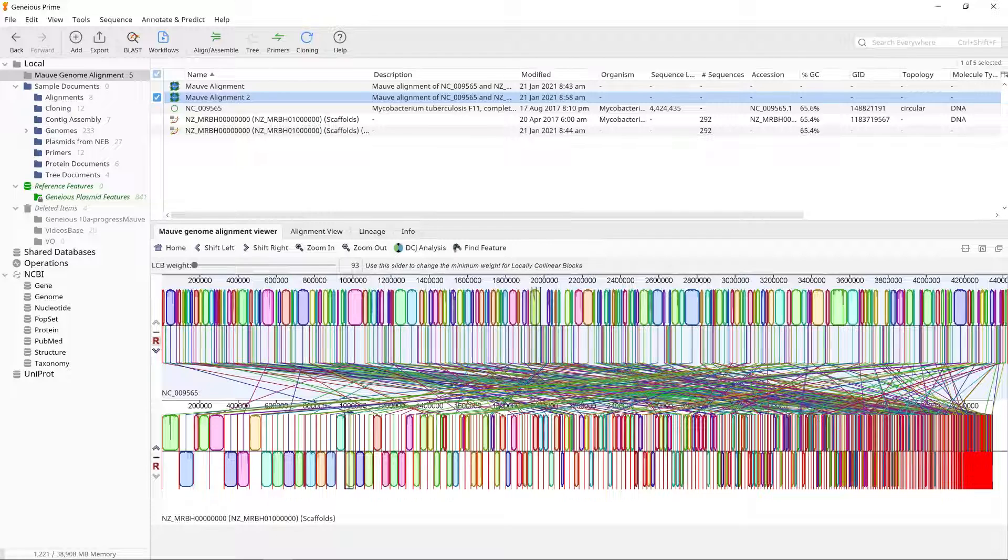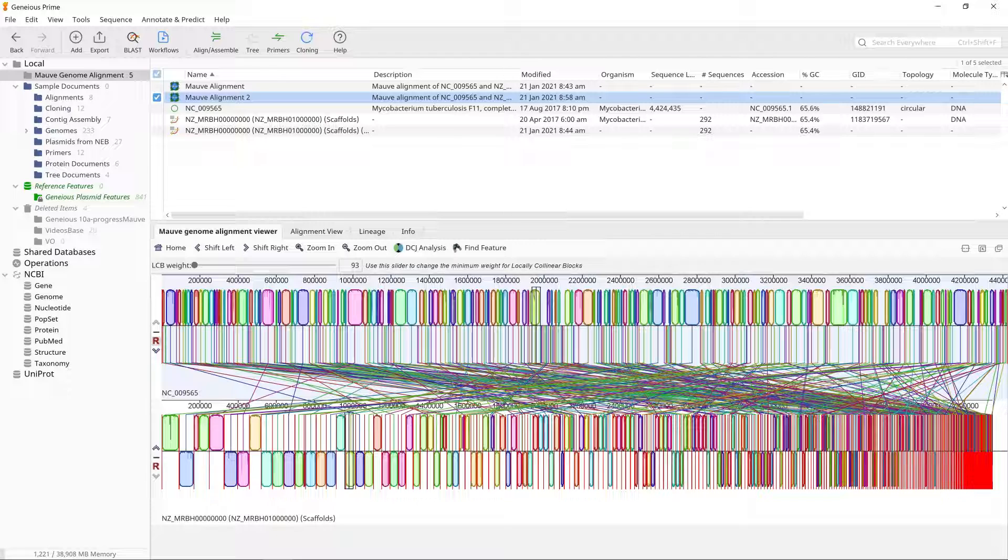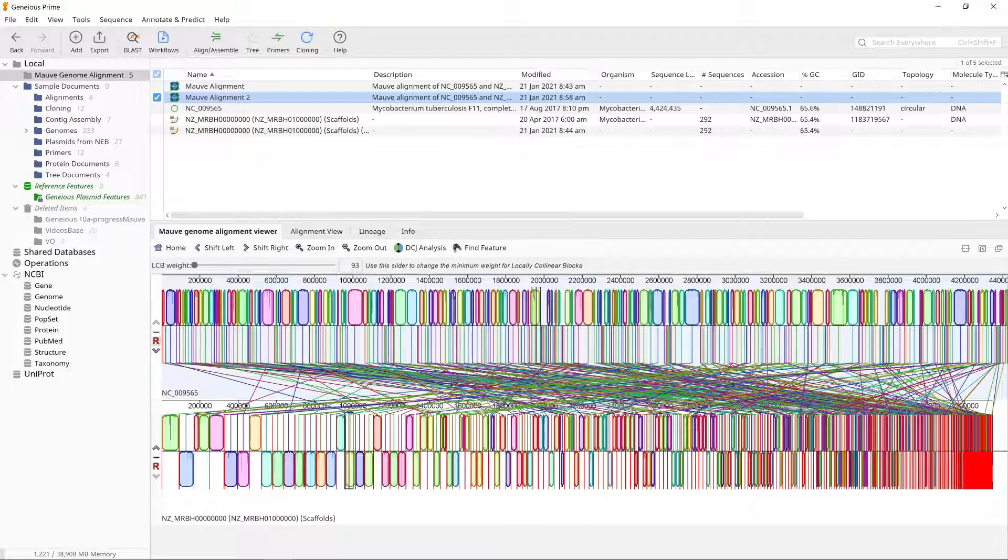As this concatenation step is unlikely to order the contigs correctly, the minimum number of LCBs in the alignment is probably going to correspond to the number of contigs in your list, unless adjacent contigs in the list happen to be in the correct order.